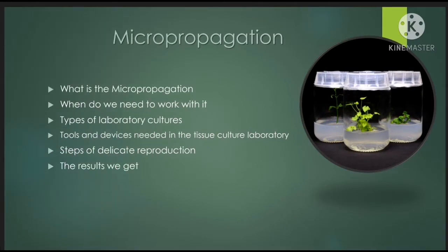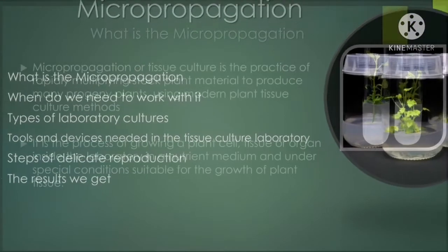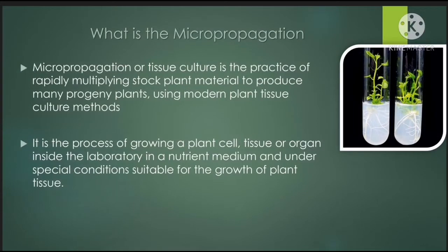Today we talk about micropropagation. What is micropropagation? When do we need to work with it? Types of laboratory cultures, tools and devices needed in the tissue culture laboratory, steps of micropropagation, the results we get.